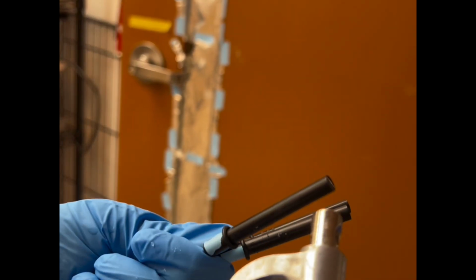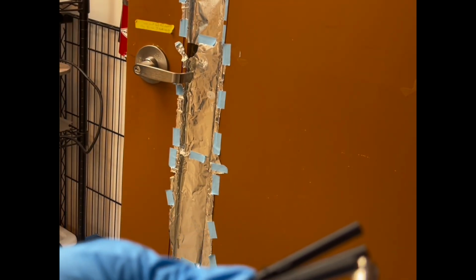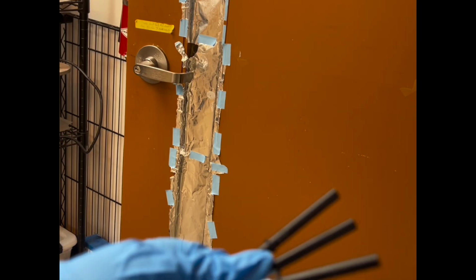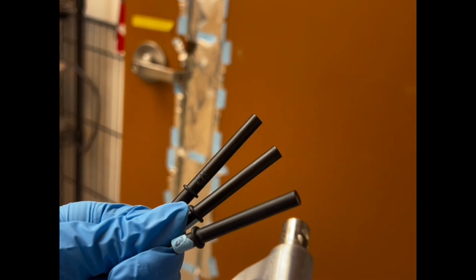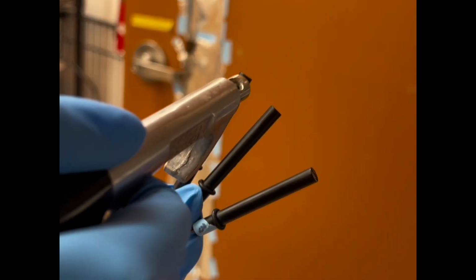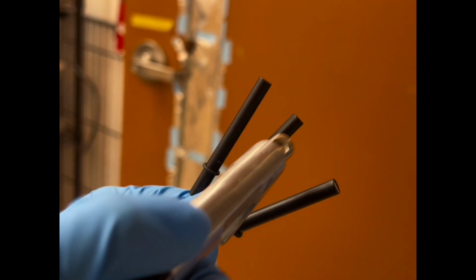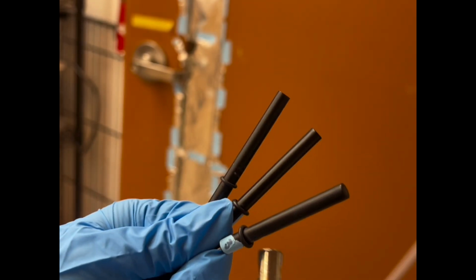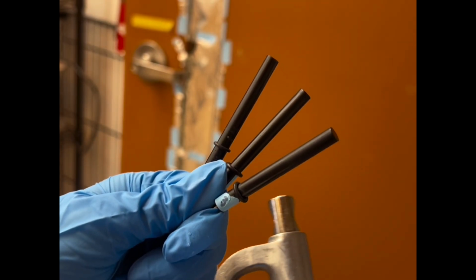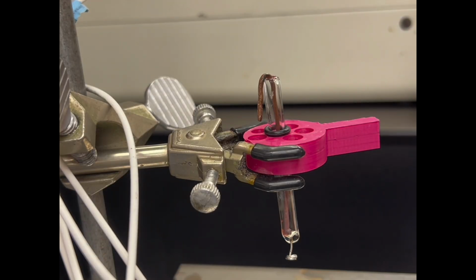We will rinse the whole electrode and also blow the whole electrode with nitrogen, but make sure we just blow it horizontally, because we don't want to directly blow on the end of the electrode, which might break our electropolymerization on the electrodes.